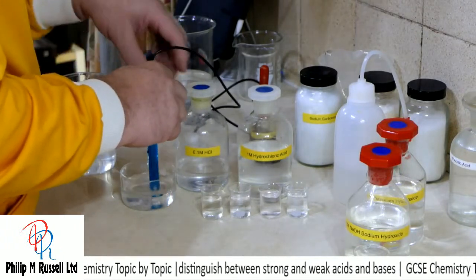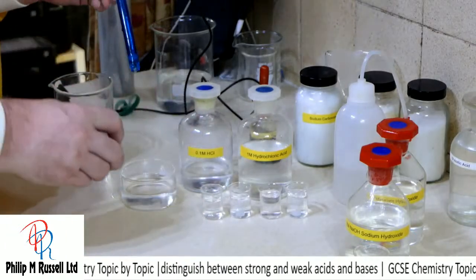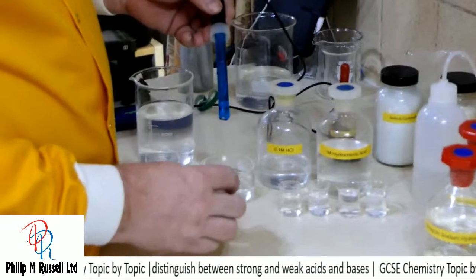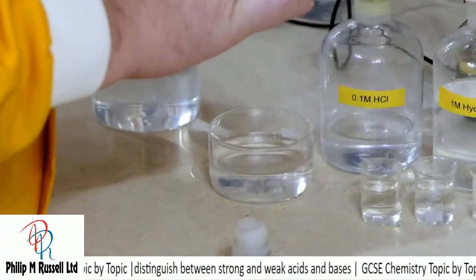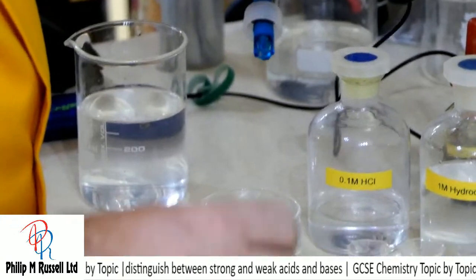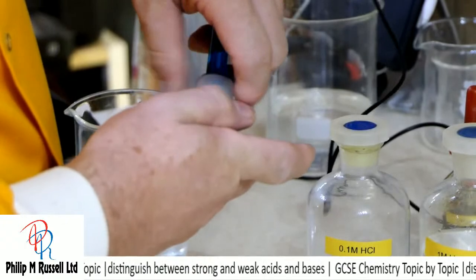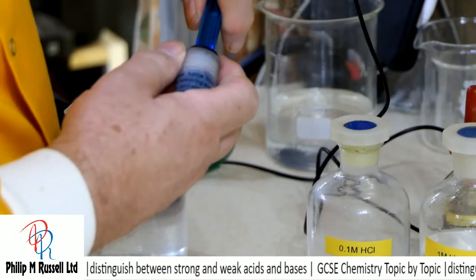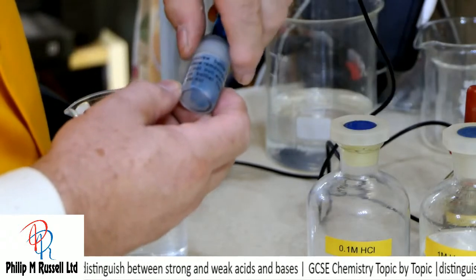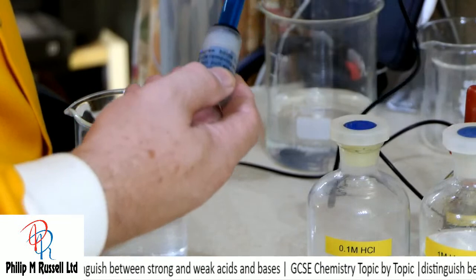We've probably still got some other ions in there. And then when I finish with my pH probe, what I'm going to do is store it away safely, and we're just going to pop it into a solution, and this solution is about 4 molar potassium chloride.